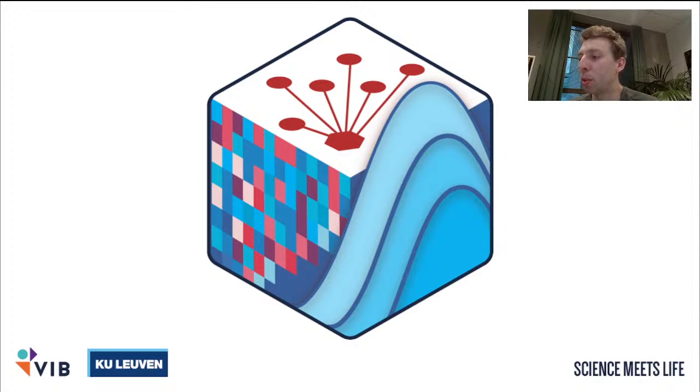Then some person is commenting that using pickle or dill to store data is very memory inefficient. Yeah, this is true. This is also why we are moving away from pickle and dill. So for SCENIC+, there's no pickle anymore. For pycisTarget, also no pickle. Only for pycisTopic we still have some things we save using pickle, but here we're also moving away from this and moving to AnnData.